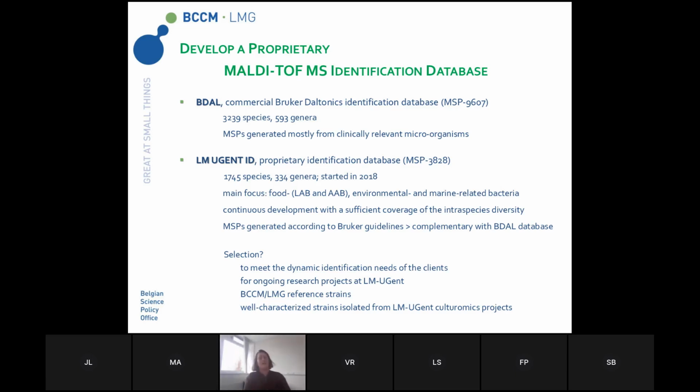But we still decided to create our own proprietary identification database. As we also heard yesterday, that is actually the way to go if you want to uplift that identification process using MALDI-TOF MS. So at this moment, well, we started in 2018.